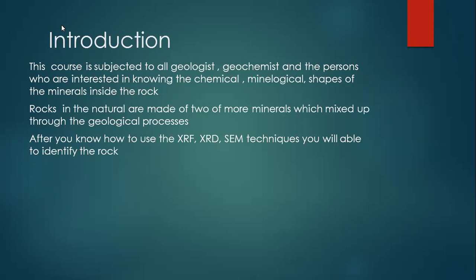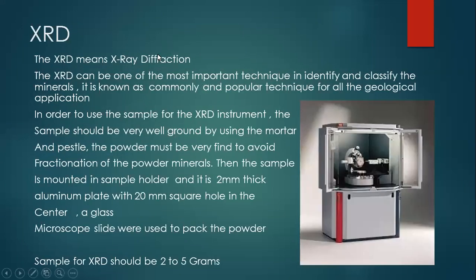Now we will start talking about what is the XRD and what is the meaning of the XRD. The XRD means X-ray diffraction. And the XRD is one of the most important techniques to know the mineralogical characteristics of each sample we have, and to identify and classify the minerals. It is known as a common and reliable technique for all geological applications.